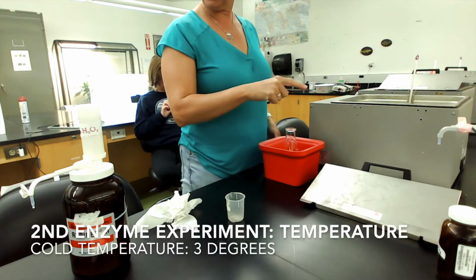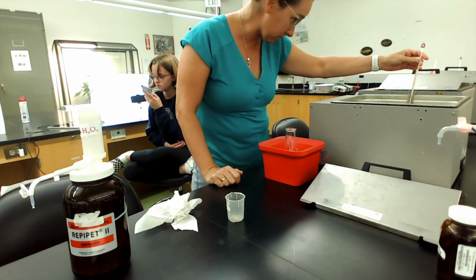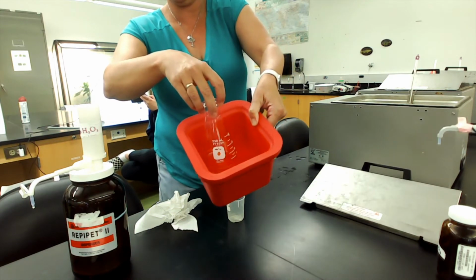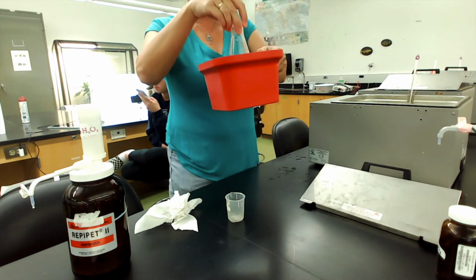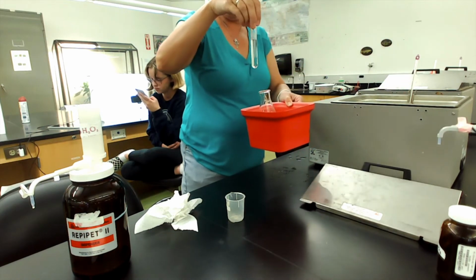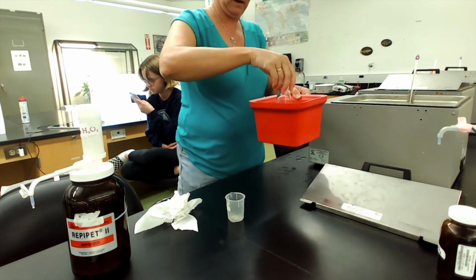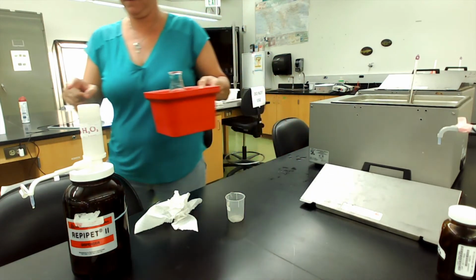So what I'm doing over here is, this is my cold water bath, which is currently at about 1 or 2 degrees Celsius. I have filled up this little bucket with the same ice water that's in the bath, and then I put my flask that I'm going to pour the hydrogen peroxide that's been sitting in the bath for over 10 minutes. I'm going to pour it in here. The reason I'm setting it up this way is so that the hydrogen peroxide does not warm up during the course of the experiment.